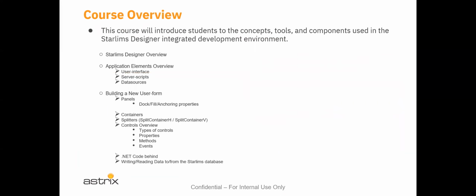We're going to look again at the STARLIMS Designer overview, how to launch it, from where it is launched in the STARLIMS system, and how to access it. We spoke a little bit yesterday about features, users for licensing. And unless someone has been, one, created in the system as a user, and then two, assigned a designer license using one of the MHD mobile and HTML designer licenses, that person would not have access to the designer in STARLIMS. We're going to look at the actual interface.